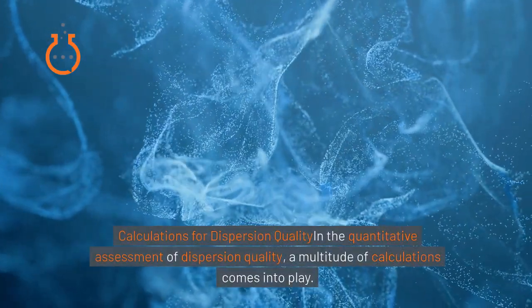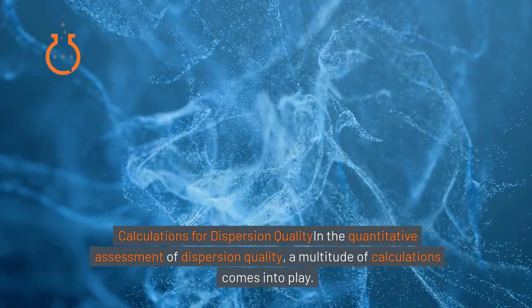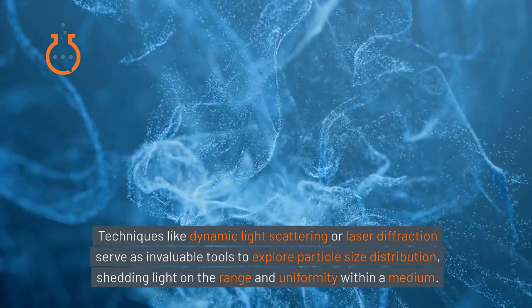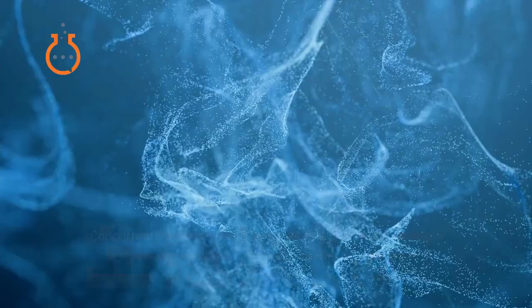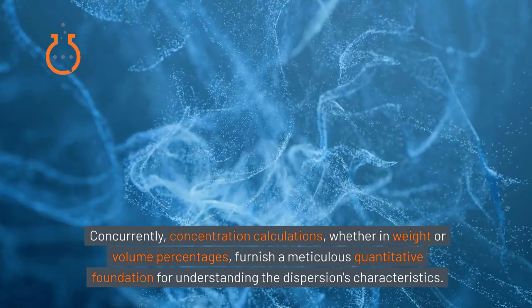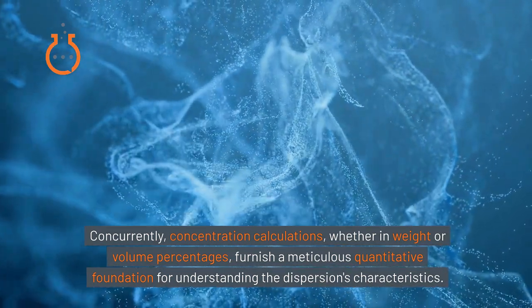Calculations for dispersion quality. In the quantitative assessment of dispersion quality, a multitude of calculations comes into play. Techniques like dynamic light scattering or laser diffraction serve as invaluable tools to explore particle size distribution, shedding light on the range and uniformity within a medium. Concurrently, concentration calculations, whether in weight or volume percentages, furnish a meticulous quantitative foundation for understanding the dispersion's characteristics.